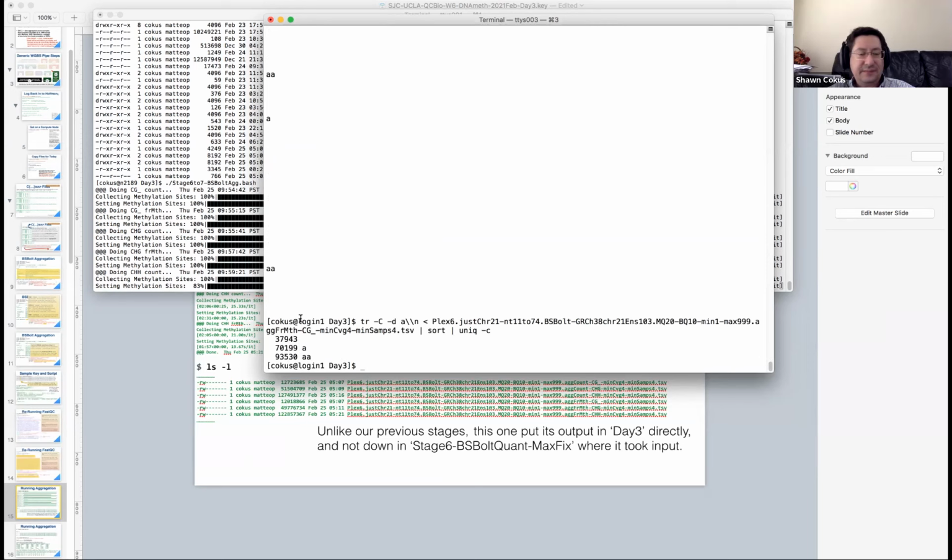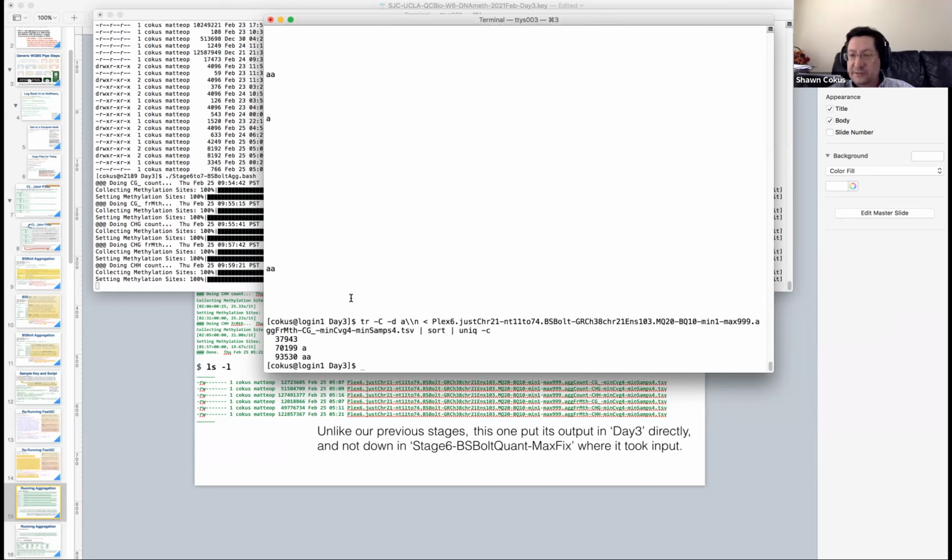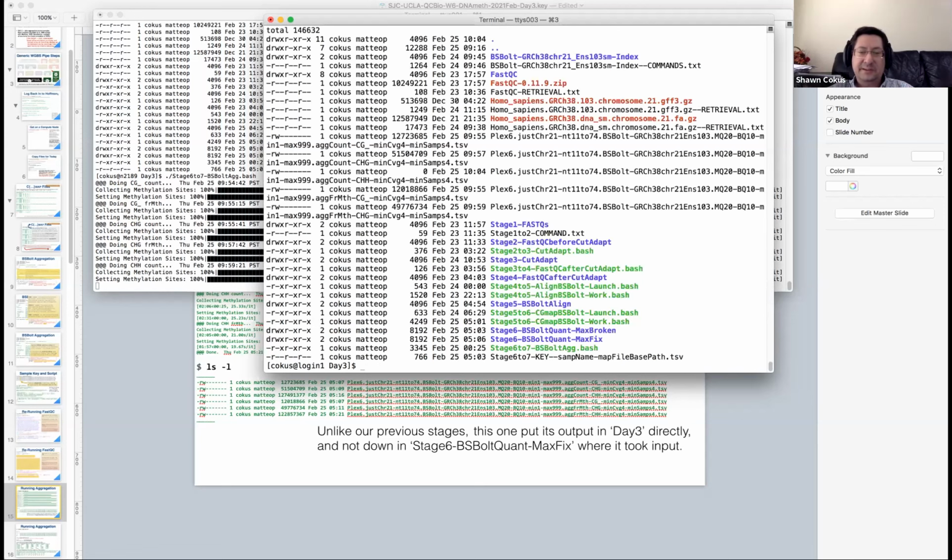So we see 0, 1, and 2 missing, and it's exactly the threshold we asked for. So, working as designed. But I tell you, if you did it with the number where the fraction is supposed to be, then you also get 3's. But this is working as expected.